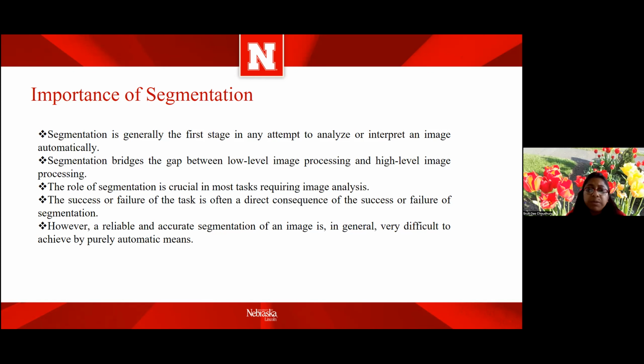However, a reliable and accurate segmentation of an image is in general very difficult to achieve by purely automatic means. That is why we take into consideration semi-automated techniques, and a few of the semi-automated techniques will be demonstrated in this workshop today.